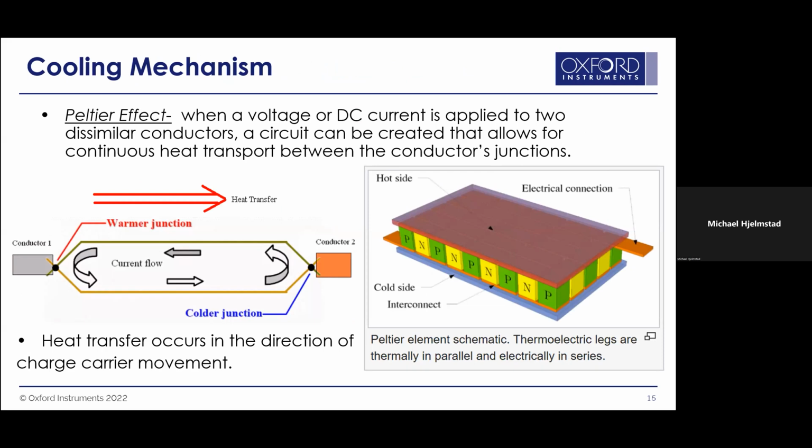The other thing that we've been able to improve, if you're used to your liquid nitrogen EDS detectors, is that as we've lowered and lowered the noise, when we made the transition from the old lithium doped silicon detectors, the liquid nitrogen ones you're used to, to this SDD model, the noise got so low that we basically went, we don't need liquid nitrogen as a coolant anymore. There might be a way to actually build a solid state mechanism, and that's what we're doing.